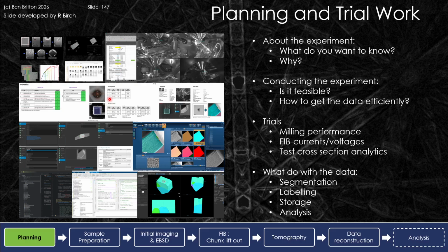Here we have effectively the preparation of the lift-out coupon, and then we're going to do the FIB-SEM tomography to do the slice-by-slice EBSD removal. And so here we're basically going to handshake the tomography wizard in the TESCAN Essence software with the EBSD produced in the Oxford Instruments Aztec software. And then once we have collected all of this data, we do some post-processing in a combination of Python, Dragonfly and MATLAB to then enable us to produce a visualization of this structure.